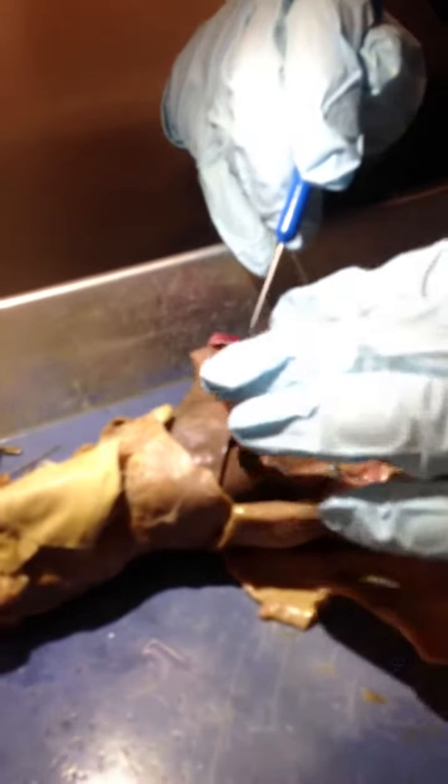Then this first loop right here is your duodenum, and then all the kind of brown stuff in that duodenum is the pancreas. So just like in the fish, the pancreas is located in the duodenum. Okay? And then all this is kind of jejunum and ileum until you get to this part, which is the cecum, and that's for cellulose breakdown. And then it goes into the colon, and the best part to see the colon is just when it goes down. So it's just the colon.